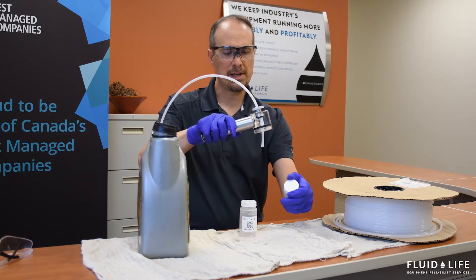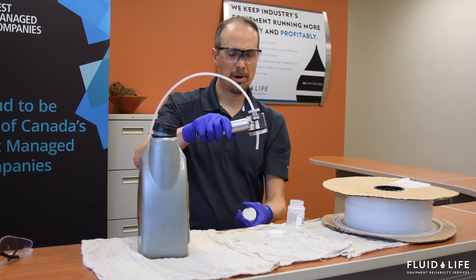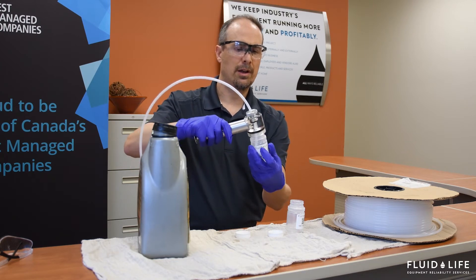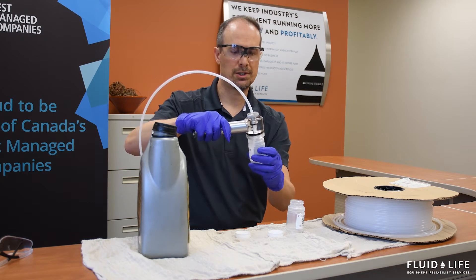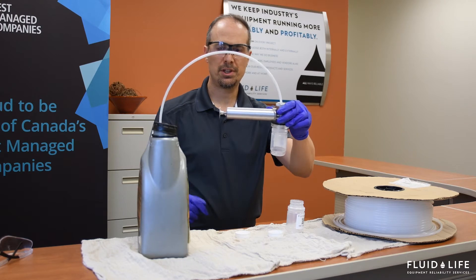Then we're going to come along with our sample bottles. The reason I have two sample bottles is because I'm going to use one of them as a flush jar and I'm going to use another one as the sample that I eventually send off to the laboratory. So I'm going to thread on my sample bottle. Now we're ready to proceed.